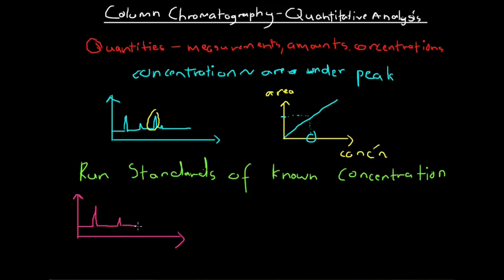And I've produced a chromatogram that looks like that. So I've got about 5 different substances in here. Now, basically what I want to do is figure out the concentration of a substance called benzene. Benzene has a chemical formula of C6H6.